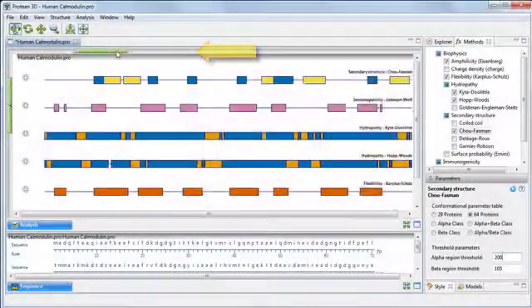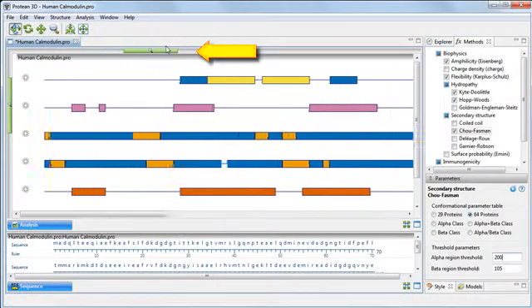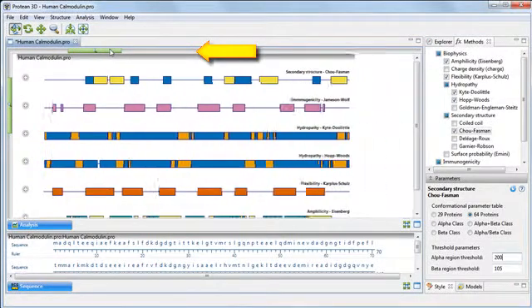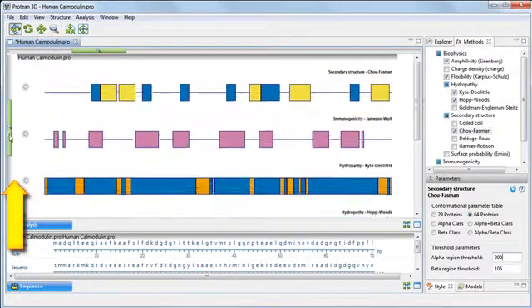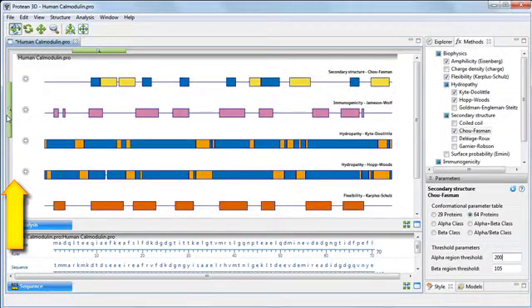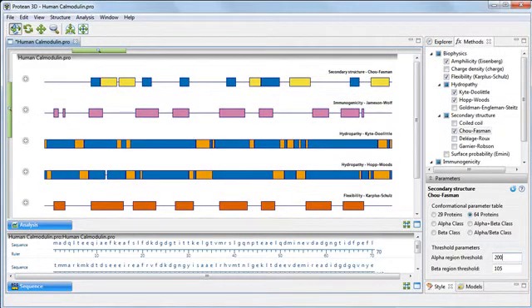Use the horizontal zoom slider or vertical zoom slider as needed for the best display.